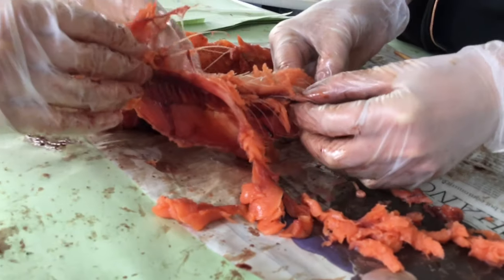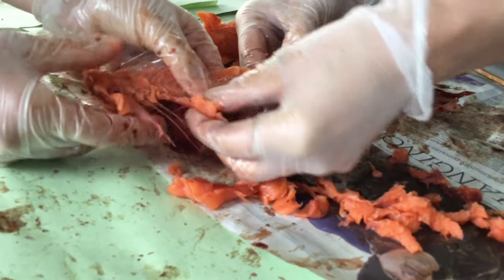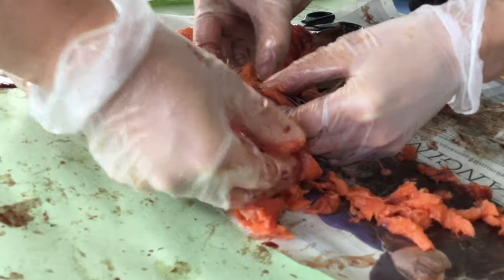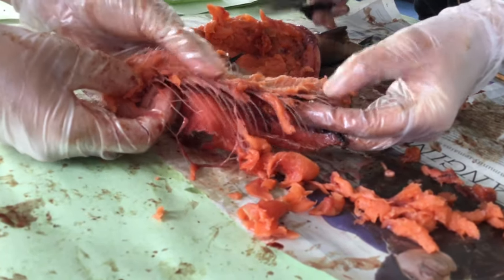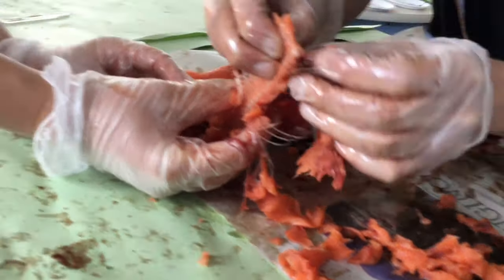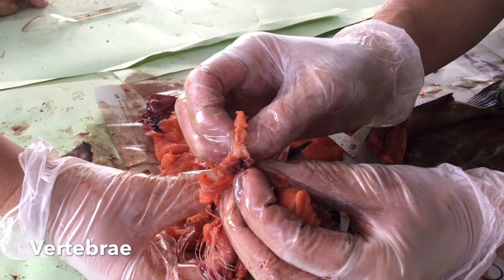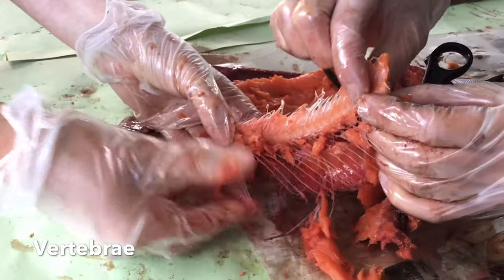Vertebrae here. Yeah. You can see the vertebrae here with the bones of the, or the cartilage bones of the ribs here. And then these are the bones that extend up into the top part of the fish. And you can see, cut this open, we can see the shape of the bone. The vertebrae are the same as what we're familiar with in people. Mm-hmm. And the spinal column is inside. Yeah, the spinal cord is inside here.